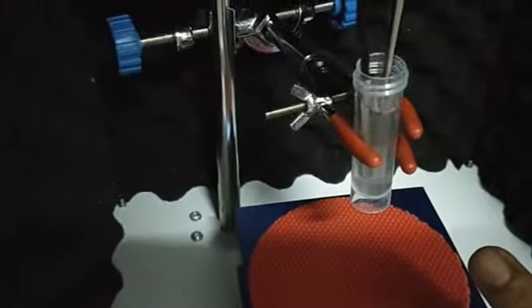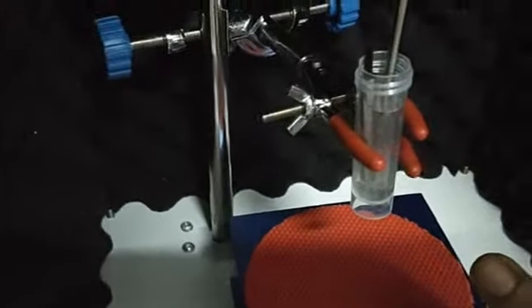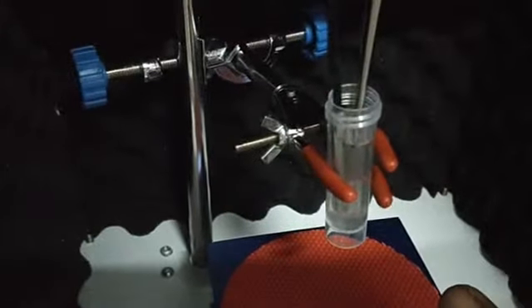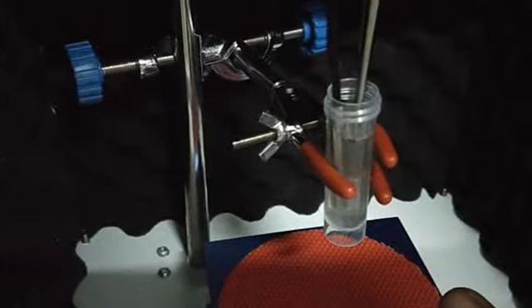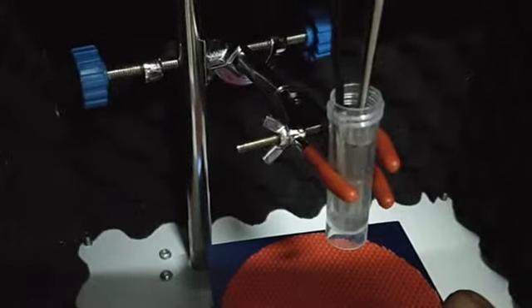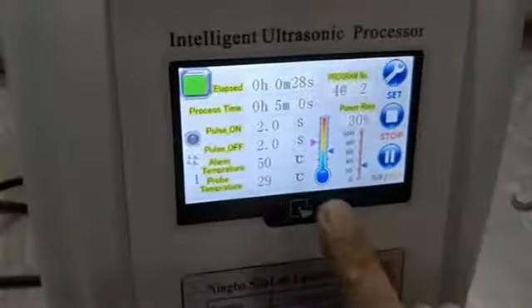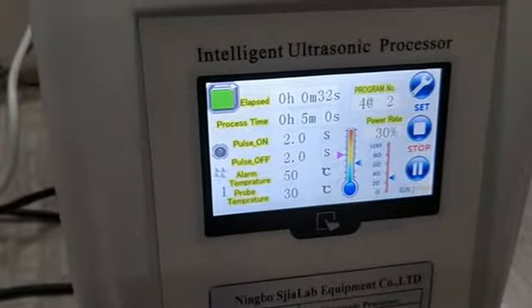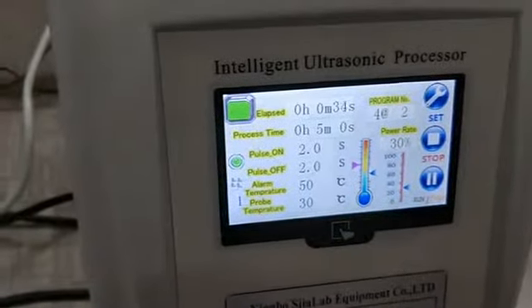You can see and hear this sound. There is an on pulse of 2 seconds and off pulse of 2 seconds. This will keep on running like this. After 5 minutes, the machine will be off. Here it also shows the total elapsed time. Now 28 seconds have elapsed. Elapsed time includes on and off both the pulses.